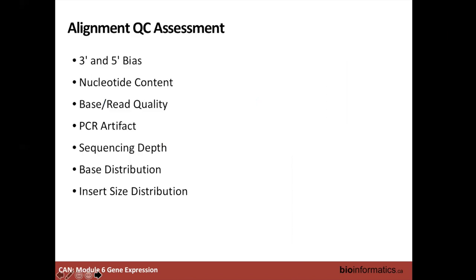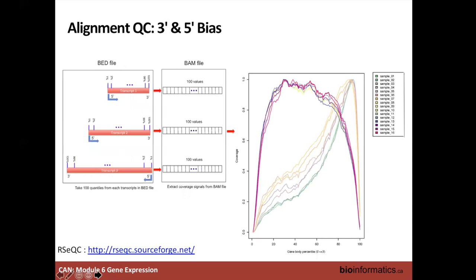We'll talk about ways to assess alignment quality, using several plots produced by tools like RSeQC. One QC check is the 3-prime/5-prime coverage bias: for every transcript, reads are binned into 100 positions and you look at coverage across those bins. Ideally reads map uniformly from the 5-prime to the 3-prime end. If you see much more read mapping on the 3-prime end, that indicates a bias — possibly two samples prepared differently with different library types. This can affect downstream analysis and clustering; if samples show different biases, you need to account for them, perhaps with batch effect correction.